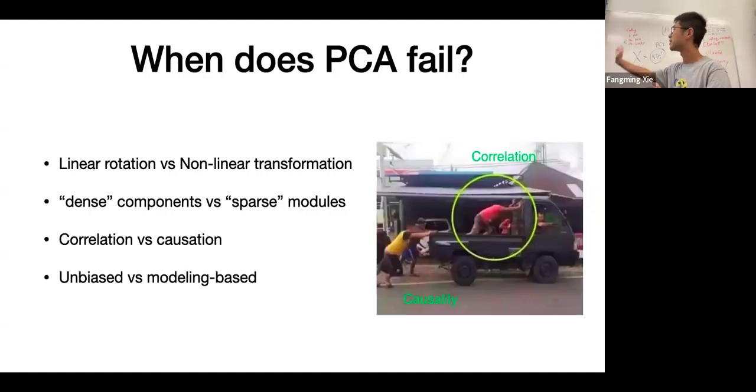And in the end, this is also a problem for all data analysis. For most data analysis, you need to make sure what you're doing and know the limits. It's always a correlation, not a causation. It's just the data in the table, and you can generate a lot of different patterns with it. It doesn't necessarily mean much unless you understand what's behind the scene.